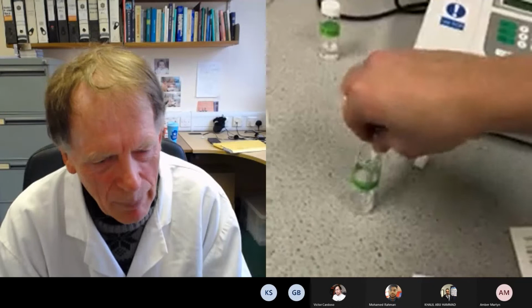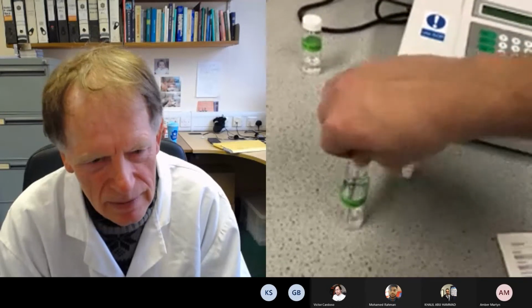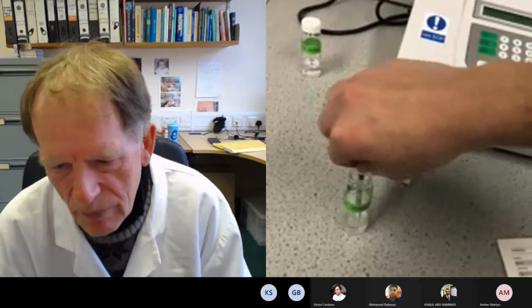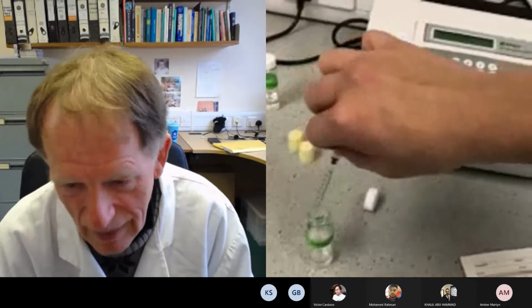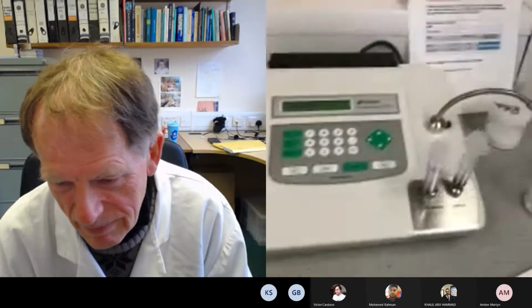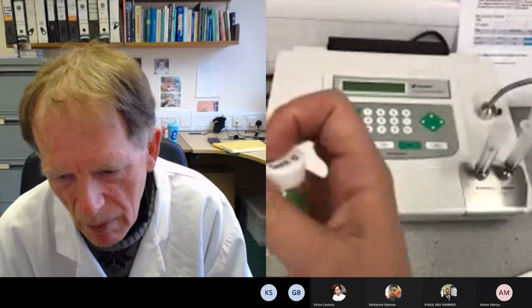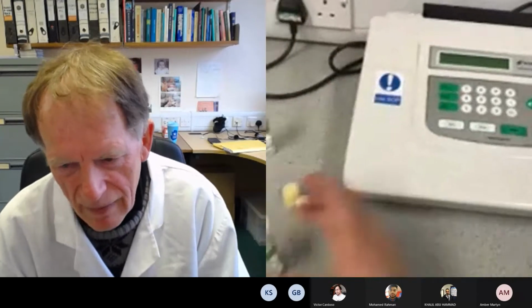Okay, so how much? It's about 1 mil. How much are you using, Vlad? Yeah, 1 ml is enough. And this time, there's no need to dilute like with a spectrophotometer. Well, it has an upper limit actually of, what is it, 2% or something like that, which means 20 mg per mil. That's very, very high indeed.